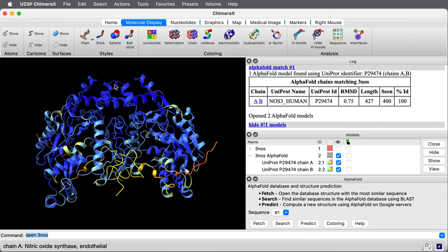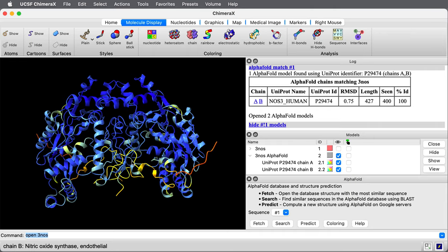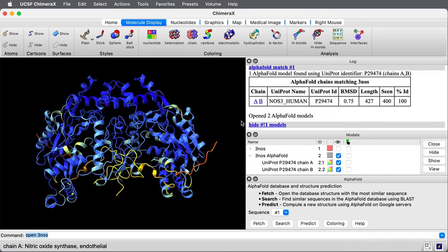It color codes it blue. Dark blue is very confident. Light blue less confident. Yellow and red are even less confident. AlphaFold made those predictions for each residue, how confident it thinks the prediction is correct.